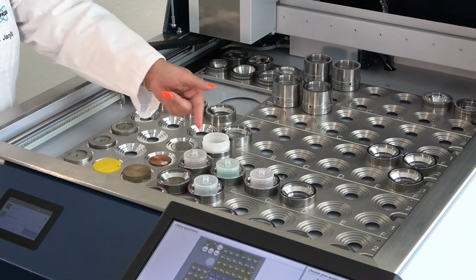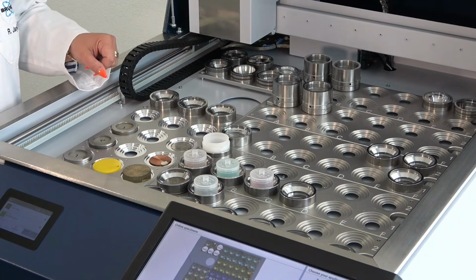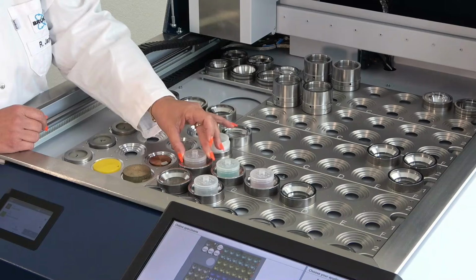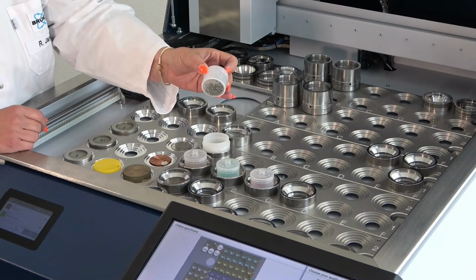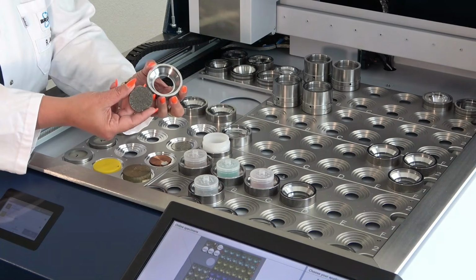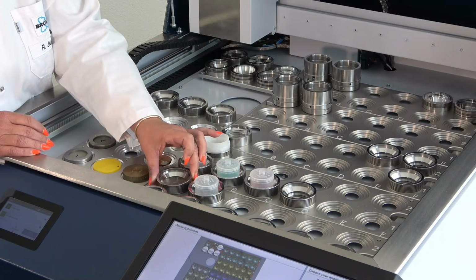I have already loaded some of the samples, which I have already shown you in the lab before. Here we have a few of the liquid samples just filled into the liquid cup. But you can also load, of course, the powder sample. This is the waste powder sample I have shown you before, and the same sample prepared as a pressed pellet. So you can easily put them into the loader and start the measurement.